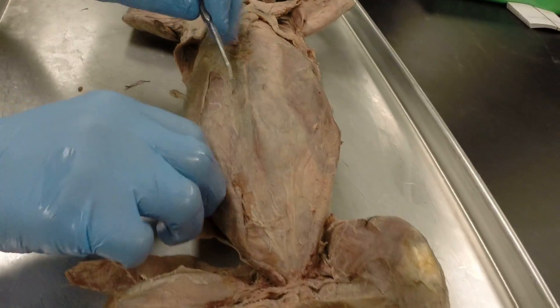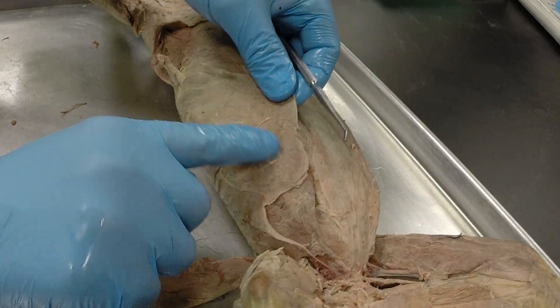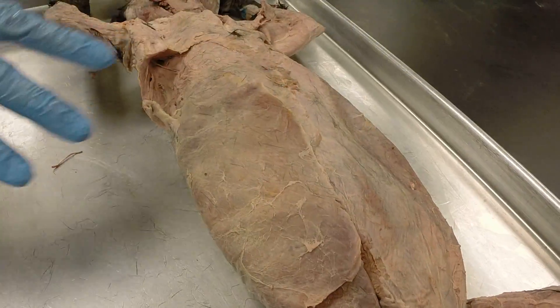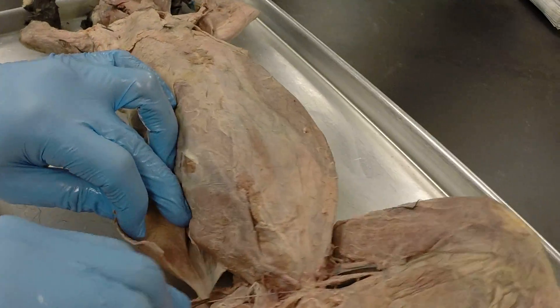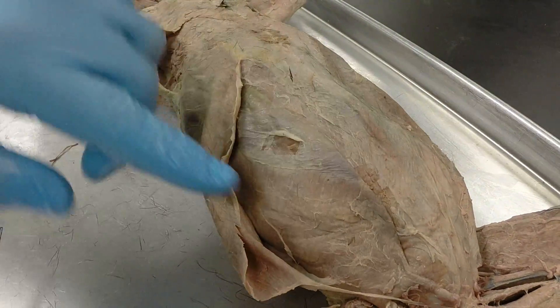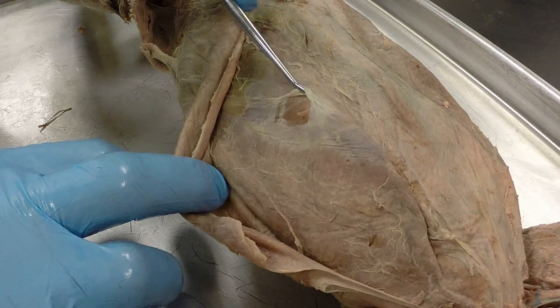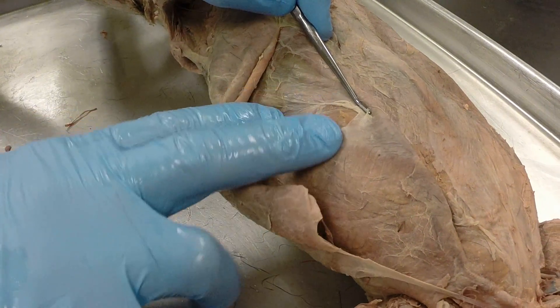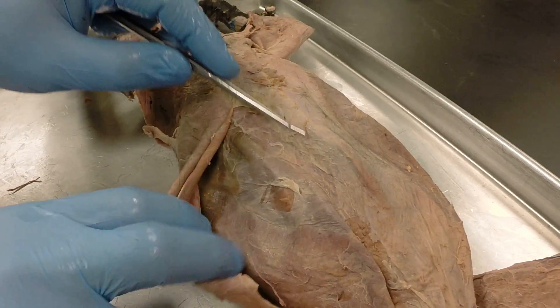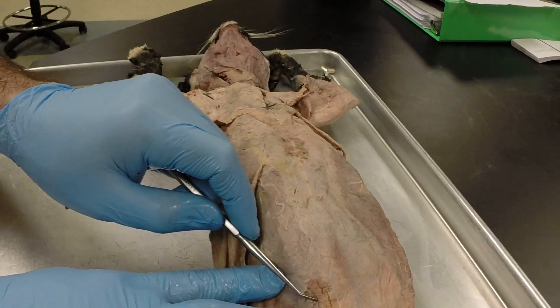Moving down to the abdominal muscles, we have a large superficial abdominal muscle — the external abdominal oblique, with fibers running diagonally. Peeling that back reveals another set of abdominal muscles with fibers running in the opposite direction — that's the internal abdominal oblique. In between those is another very thin abdominal muscle — the transverse abdominis, with muscle fibers running in the transverse plane. And then on either side running the length of the abdomen and chest is the rectus abdominis.